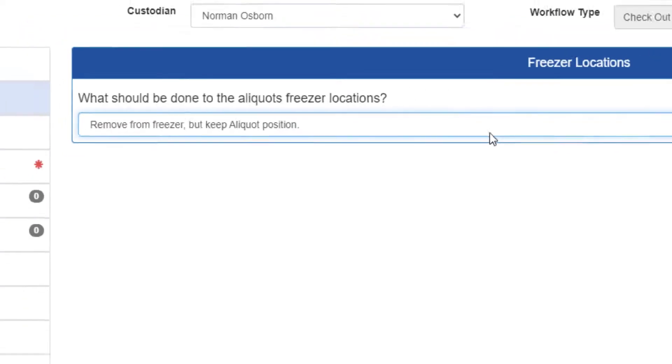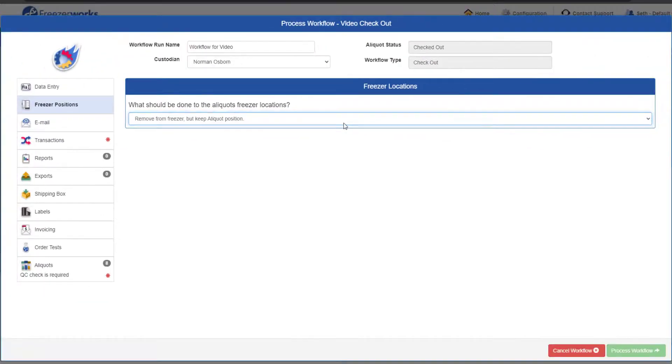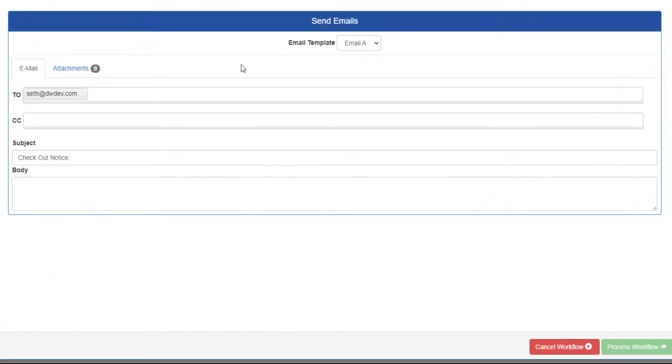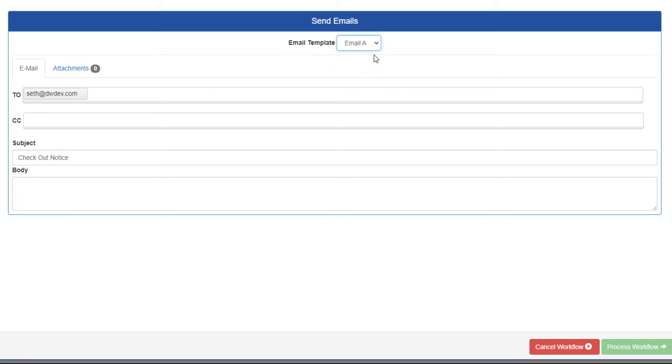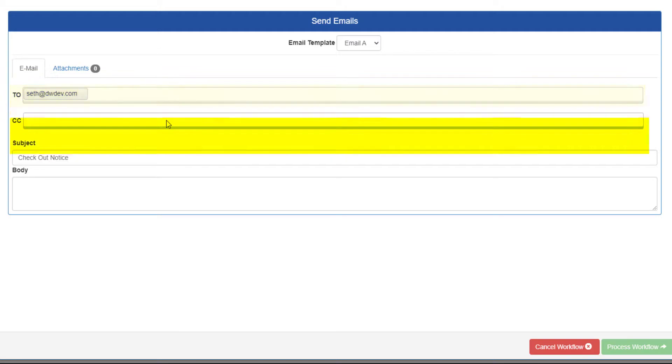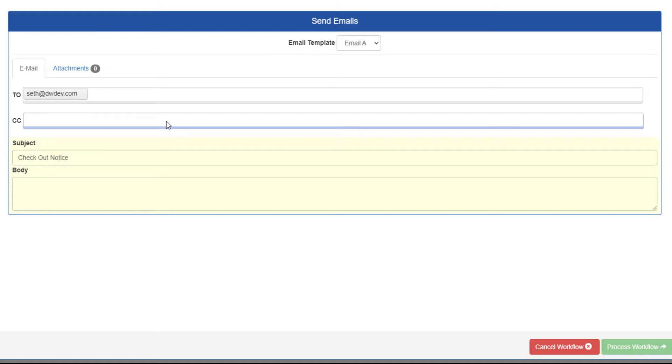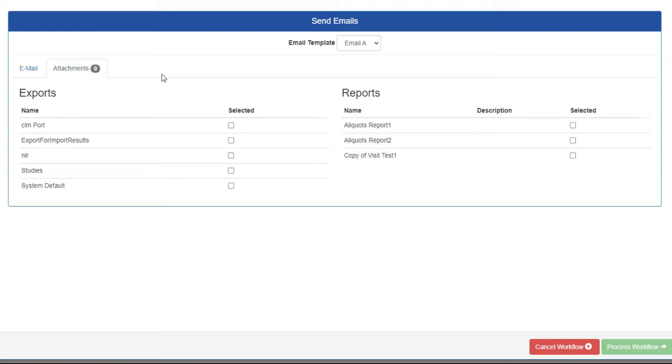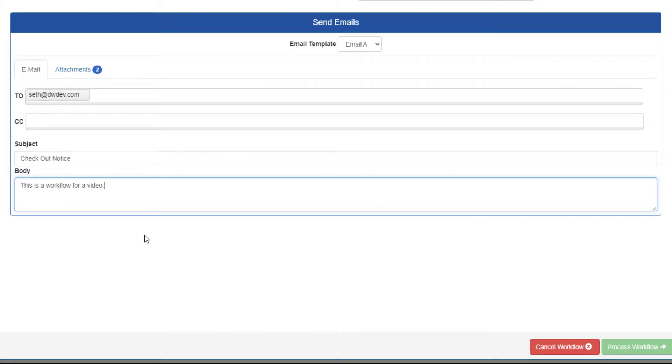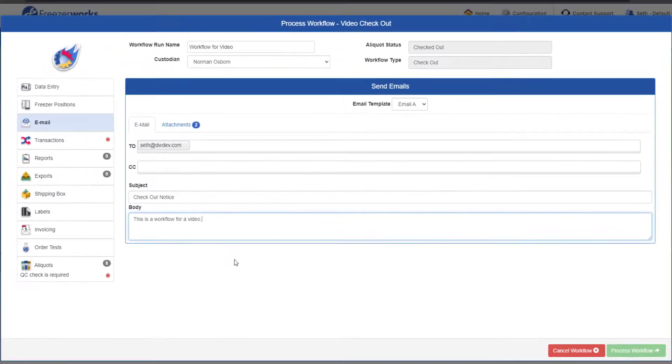If you are given control over this workflow's emails, the email page will appear. If there are multiple emails, select the desired one from the email template dropdown. The email form should look much like any standard email application. Use the To and CC boxes to select email recipients, and the Subject and Body box to craft the actual email. Don't forget to also include any desired attachments, exports, or reports by selecting the checkboxes on the Attachments tab.